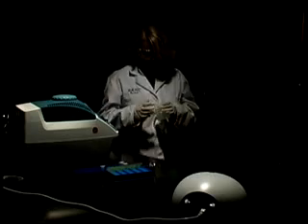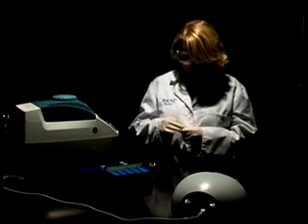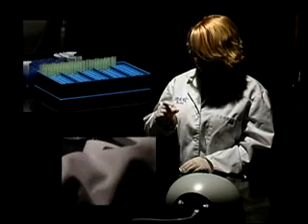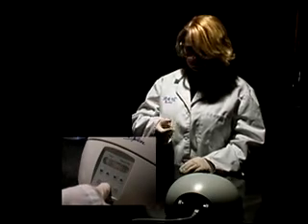Obtain a tube containing Taq polymerase, the 4 nucleotides, and buffer. Add to that the D1S80 primer and your cell DNA supernatant. Gently mix the solution and then microcentrifuge it for 10 or 20 seconds at high speed.